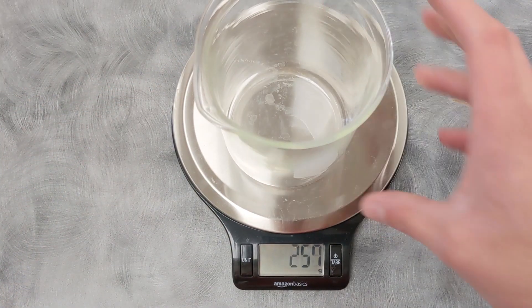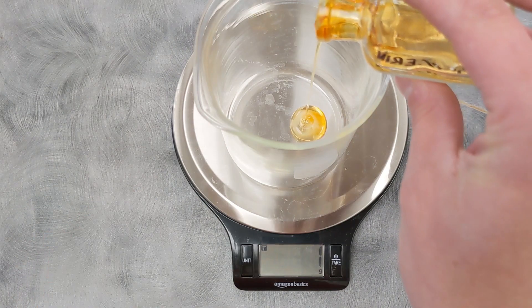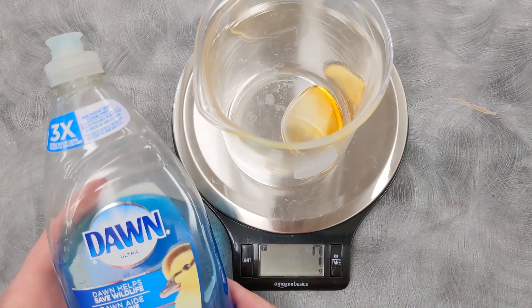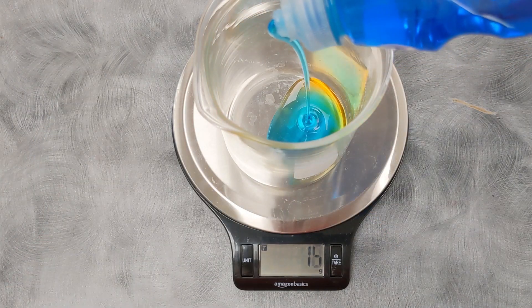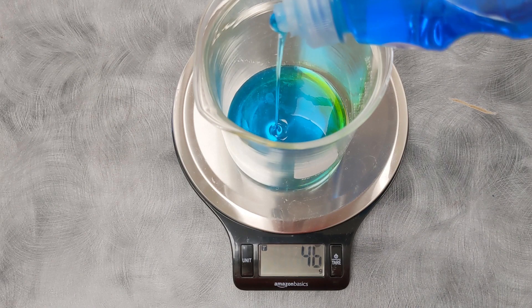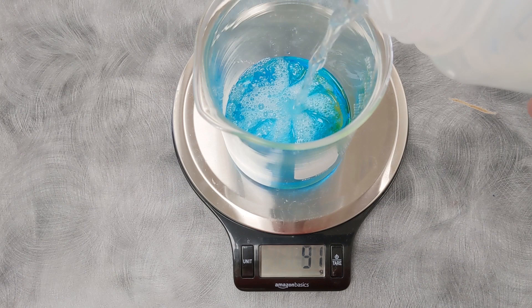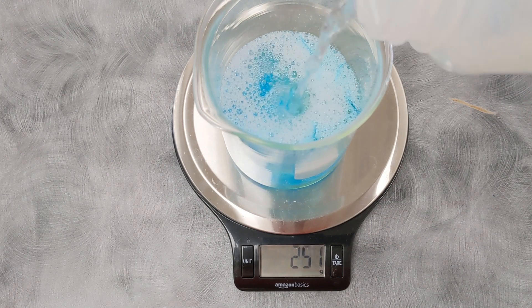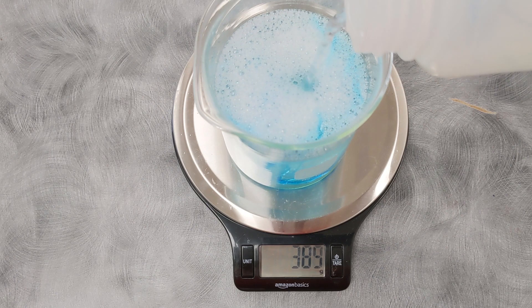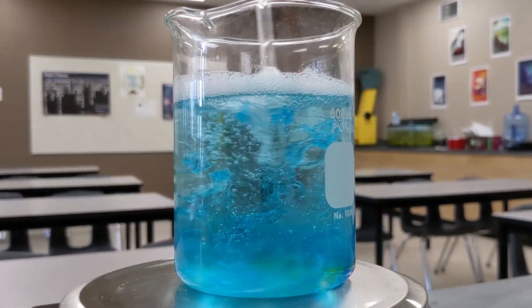Now we need to make the bubble solution. It works well to take about 6 grams of glycerin, about 40 grams of Dawn soap, along with about 400 grams of water. You could also use commercial bubble solution here. Make sure to stir well.